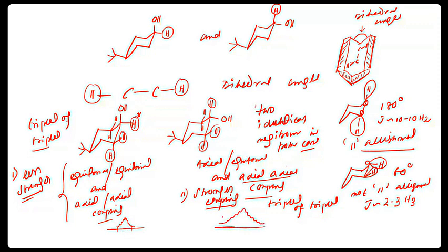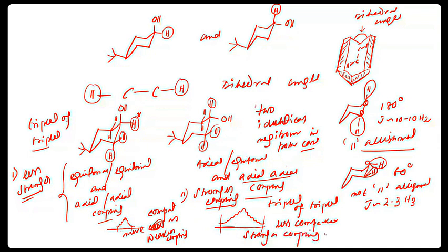more separated. So this is more concise, more concise or more compact. This is one proton, more compact, as weaker coupling. As weaker coupling, this is less compact. As stronger coupling, stronger coupling. So just identify which proton is there.